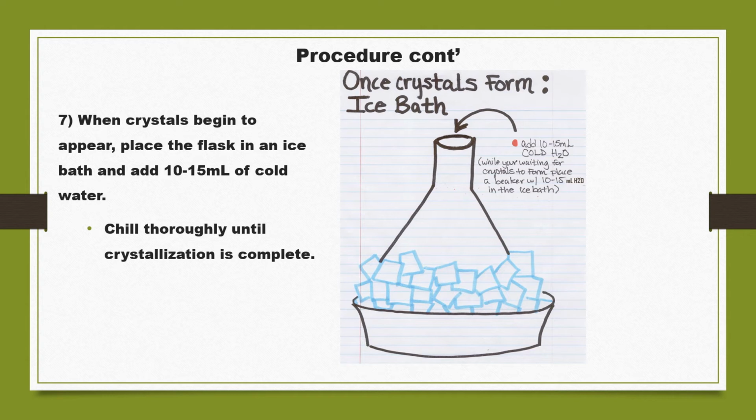In fact, you should make sure that the water is very cold, otherwise it will disturb formation of crystals rather than assist the formation of crystals.